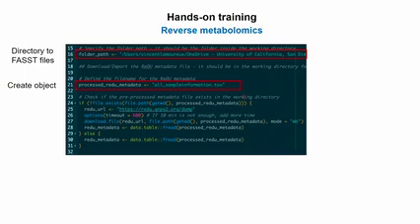So hopefully you make it here. If you need more time, let me know. Otherwise, I'll just proceed. But here you have the folder path. So the folder is just the workshop folder that you created on your desktop, right? So it's the first folder that you created. What we usually do here is automatically download the new REDU metadata. So REDU is uploaded constantly, right? So we always want to use the latest version of it.